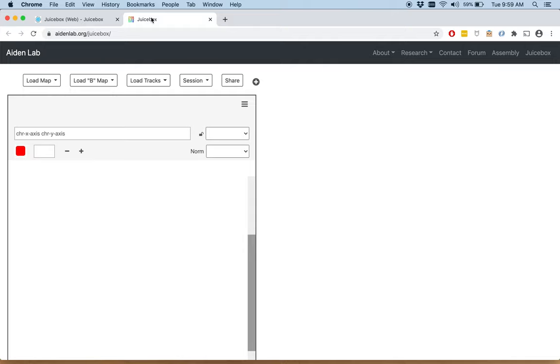JuiceBox on the web is run via client-side JavaScript. Any HI-C file can be loaded from a URL, and in particular, HI-C files that have been uploaded to Dropbox, Geo, Google Drive, Amazon S3, or any web server can be streamed. Today we're going to be streaming files that are hosted on ENCODE servers.